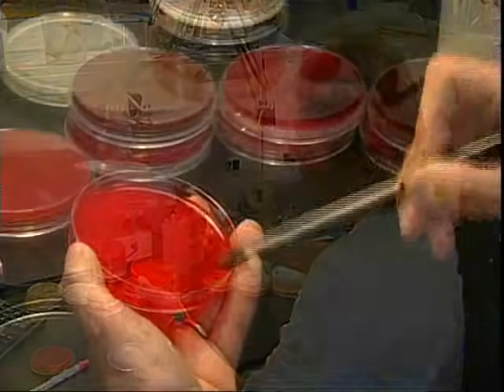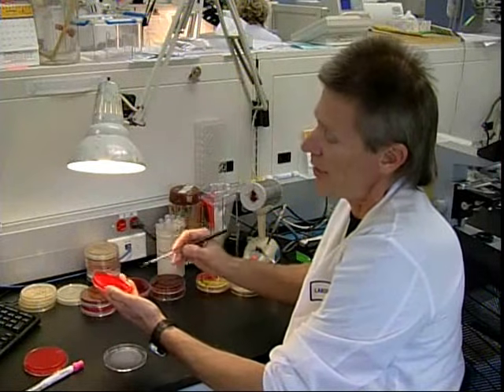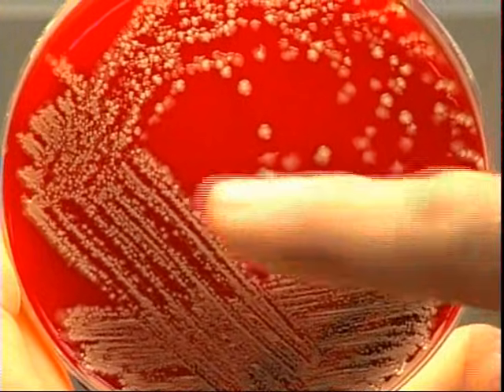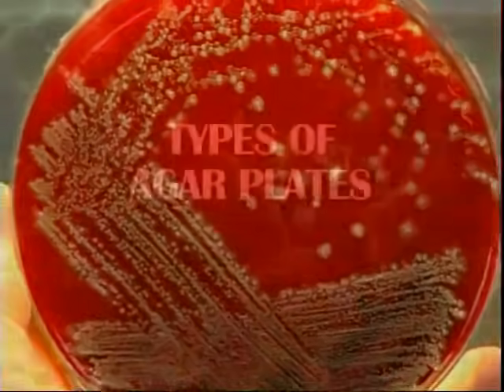Now you may wonder why we do this streaking technique. It's to spread the bacteria out, to find the specific pathogens. If I had a bag of, say, white marbles, but I was looking for one specific black one, the way to find it would be to take that bag, open it up, and spread those marbles out. That's basically what we do when we streak the plate. We're spreading out the inoculum to find the specific pathogens that might be there. As you can see, the material has been spread out, and what we have here is individual colonies. Now we can work with each individual colony and do testing on it.